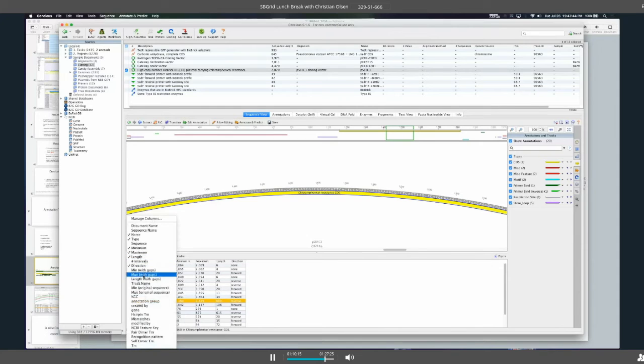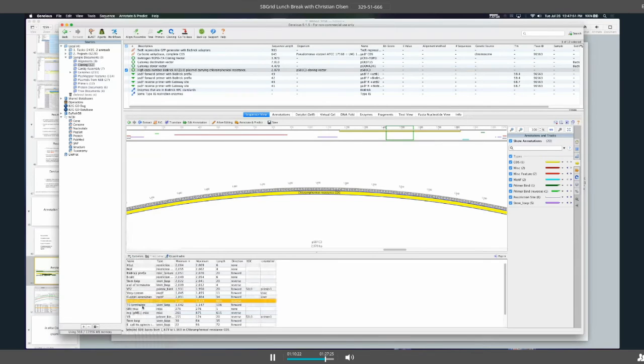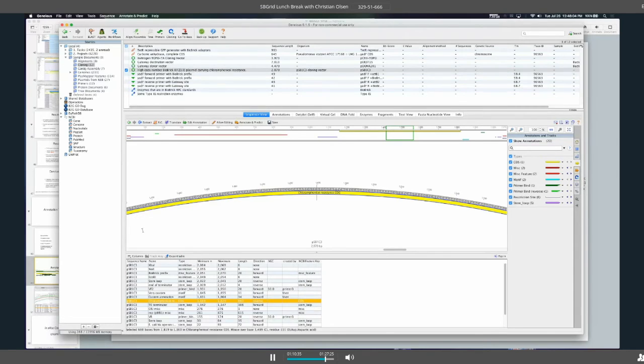So if I want to add more columns, I can click on the columns button, and I have a number of other options like %GC. I can add created by. Okay, I can add NCBI feature key. Okay, if I've downloaded the sequence data from NCBI, I've got a feature key that was assigned. Okay, I can also add sequence name. Okay, so there are a number of elements that you can add here.